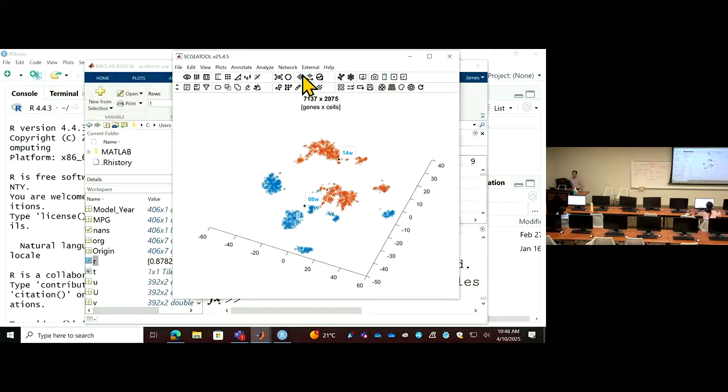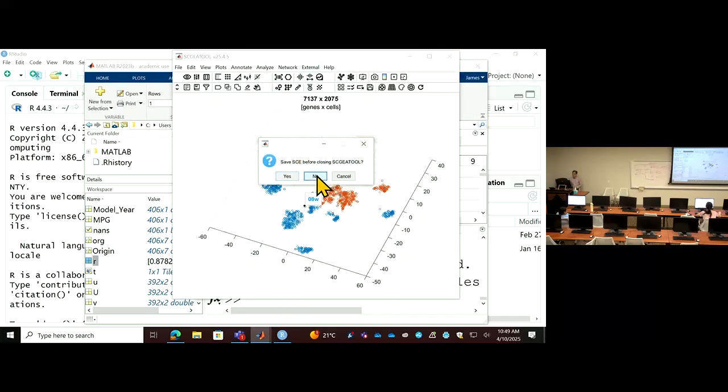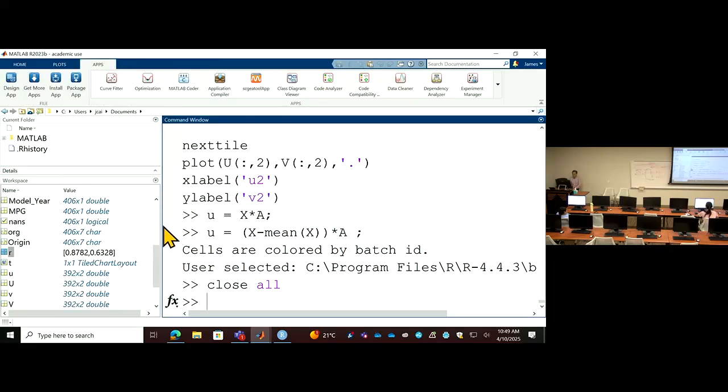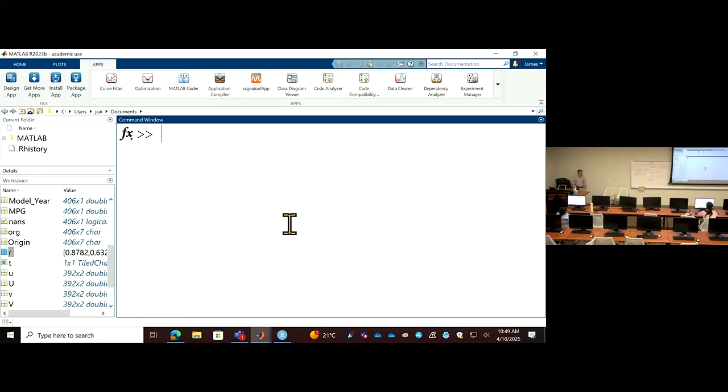Okay, I think most of you have already done this step. Because I already removed the harmony from this menu, we probably have to do some editing of source code to get it back. Okay, so let me show you how to do it. I should put it back for classroom, but in reality I found it's useless, so I removed it from the menu.